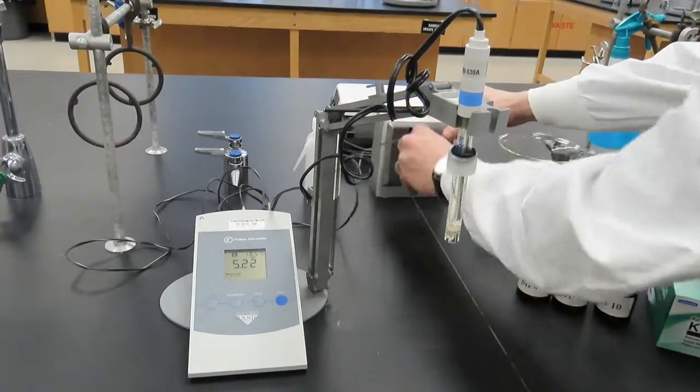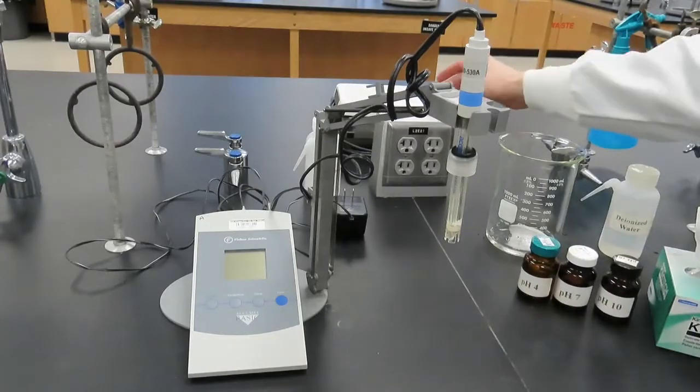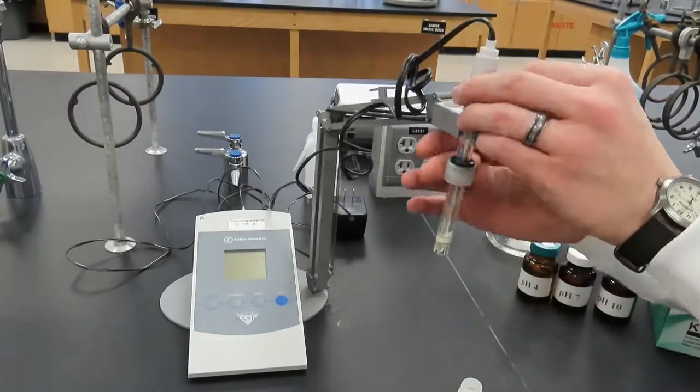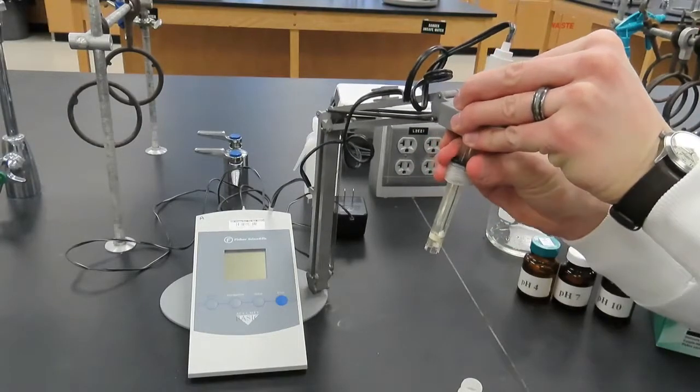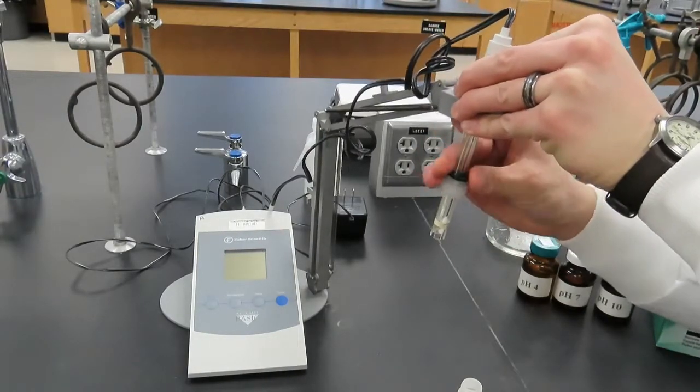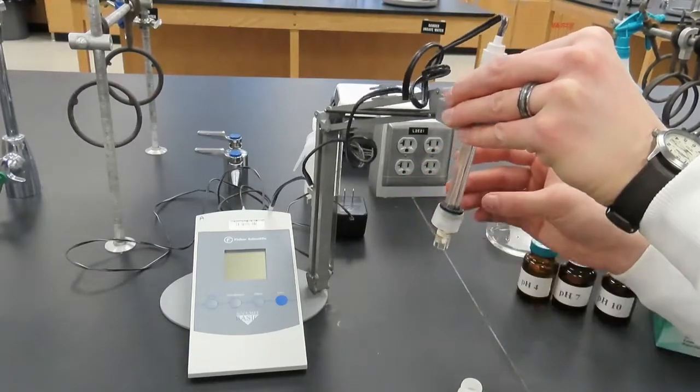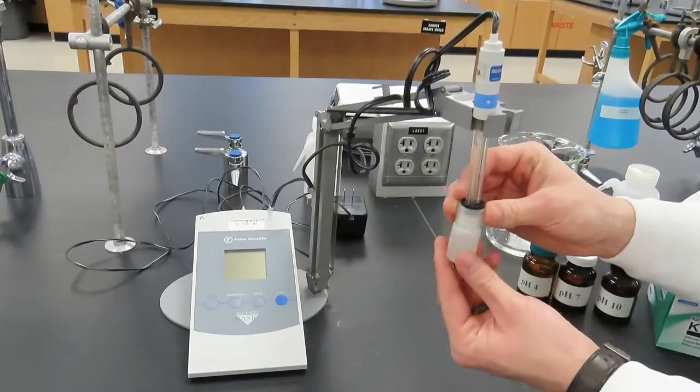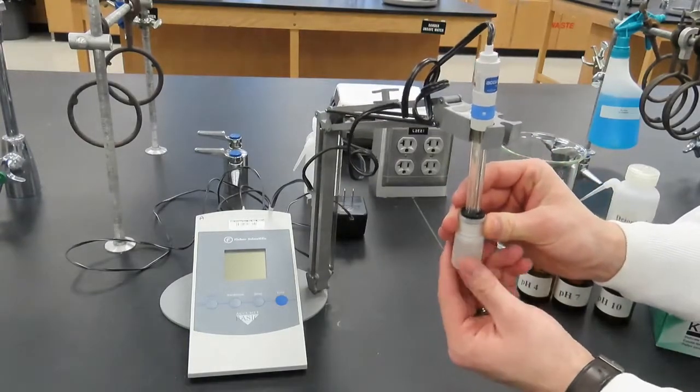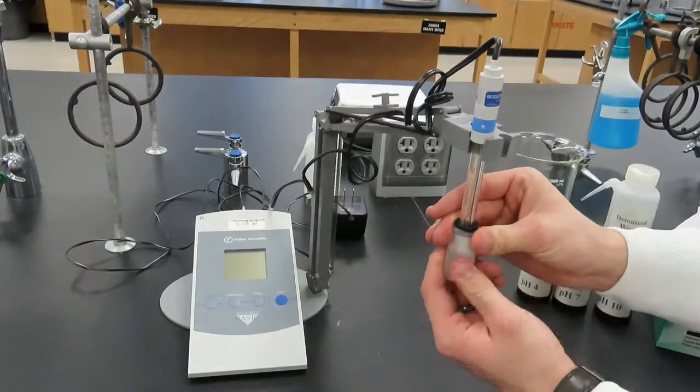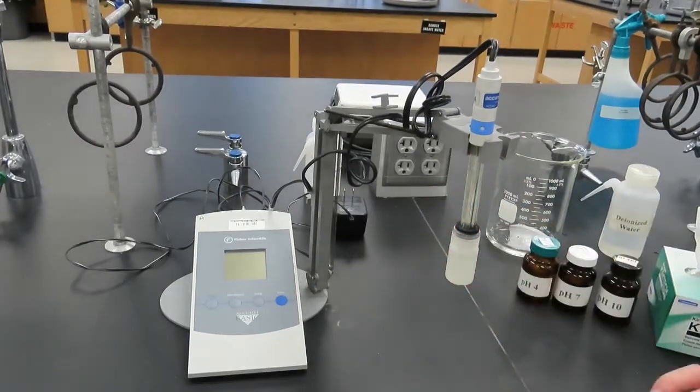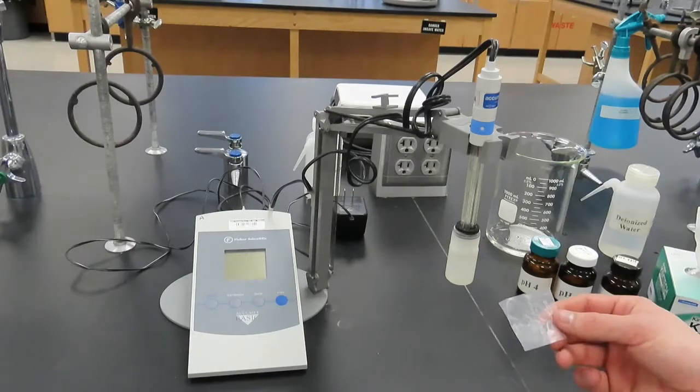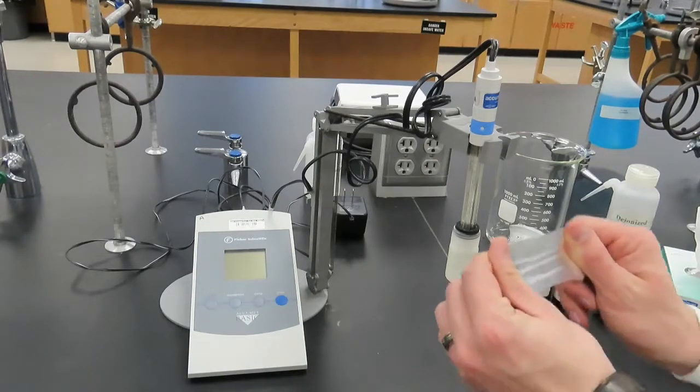When we are finished with the pH meter, we will unplug it. Re-immerse the pH electrode into its bottle of storage solution, cap the bottle, and use a piece of parafilm to wrap the top of the bottle to minimize loss of the storage solution due to evaporation or spillage.